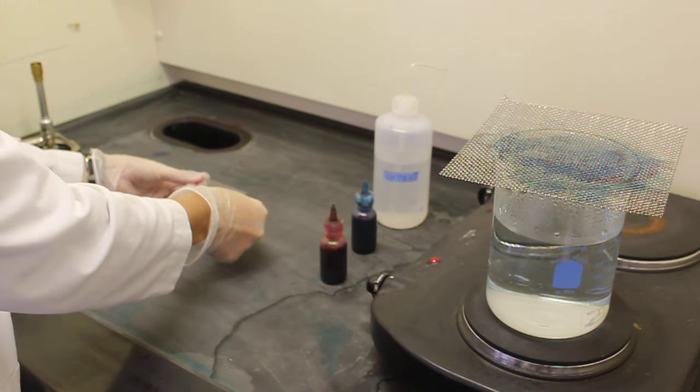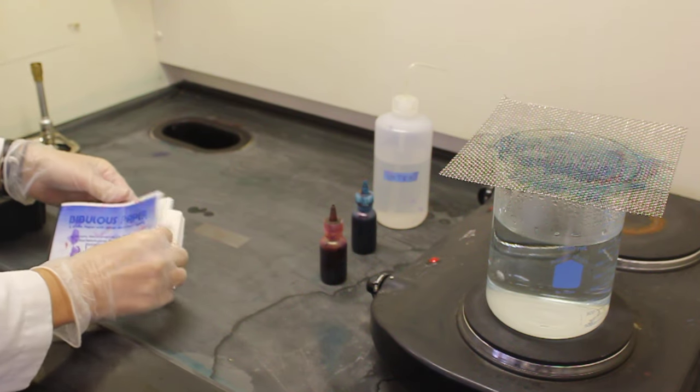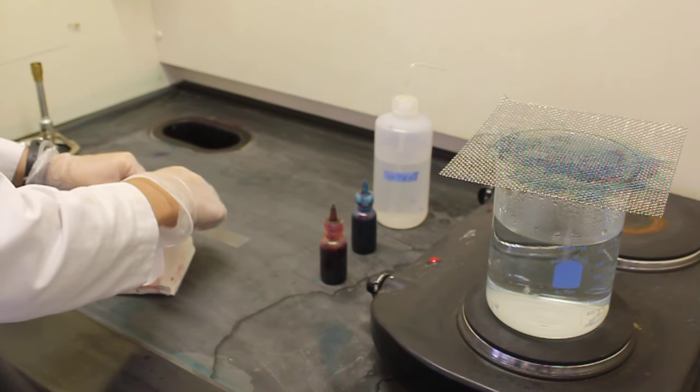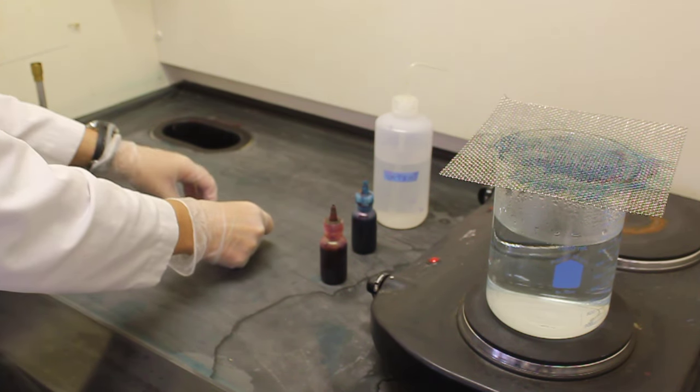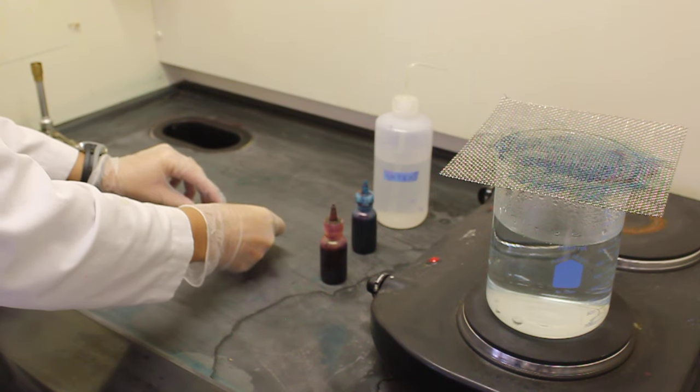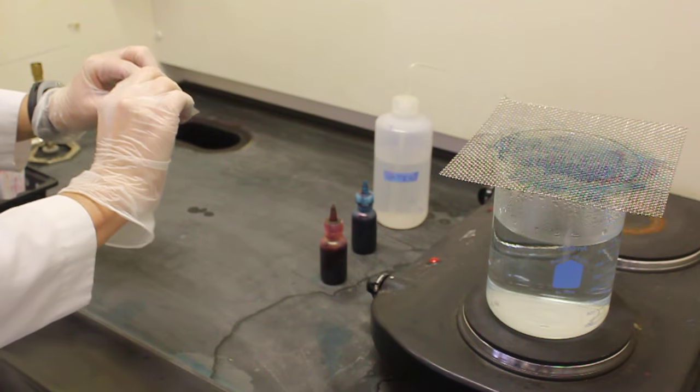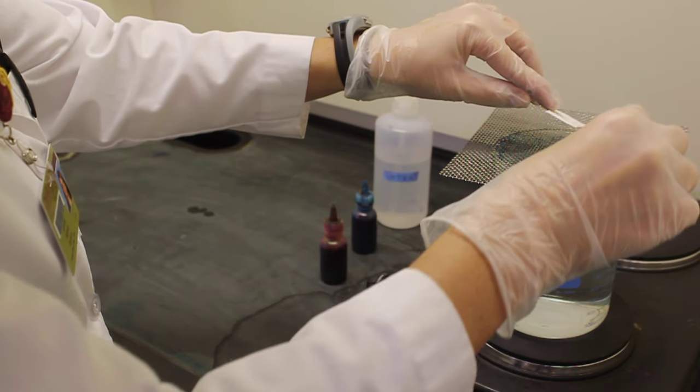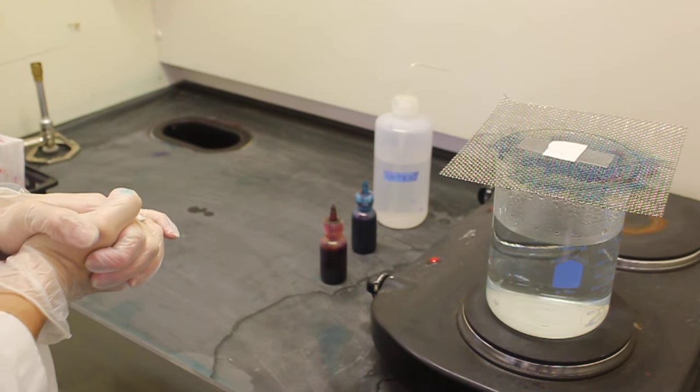To begin our procedure, I am going to get a small piece of bibulous paper and place this on top of the area that I have previously smeared and heat-fixed. I then place the heat-fixed slide and the bibulous paper on top of the steaming hot plate.